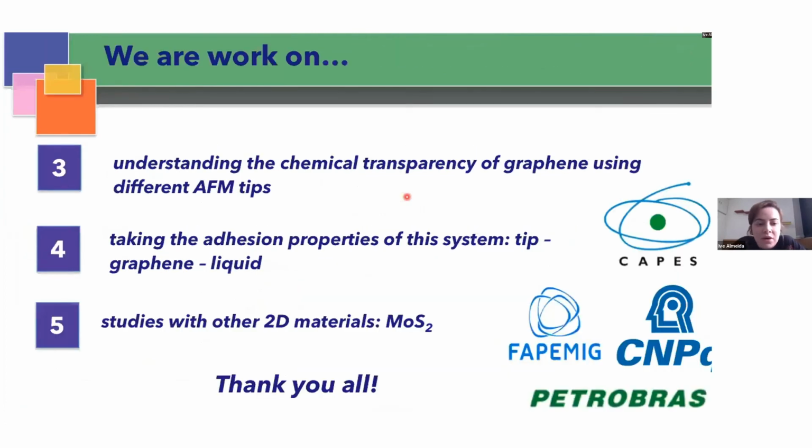Now we are working on understanding the chemical transparency of graphene using different AFM tips. We are working on measuring the adhesion properties of this system, tip, graphene, liquid, and we started to transfer other 2D materials into the platform, such as molybdenum disulfide.